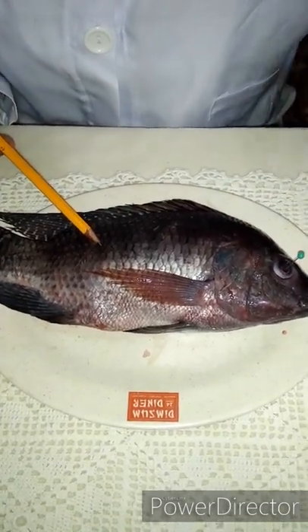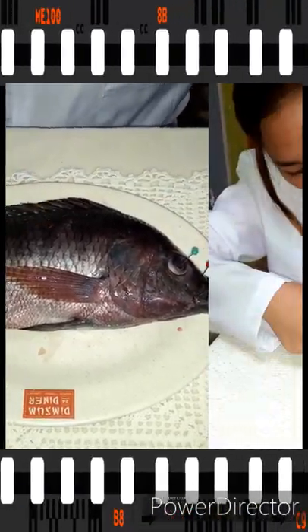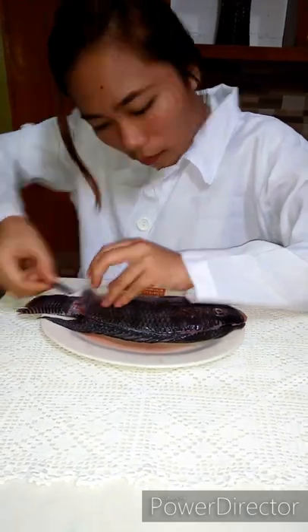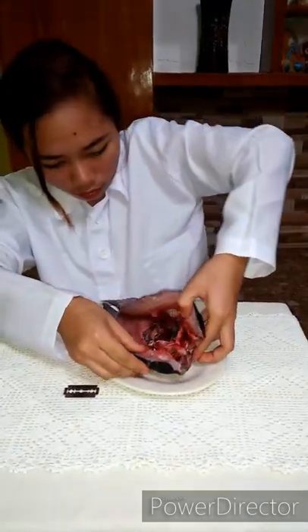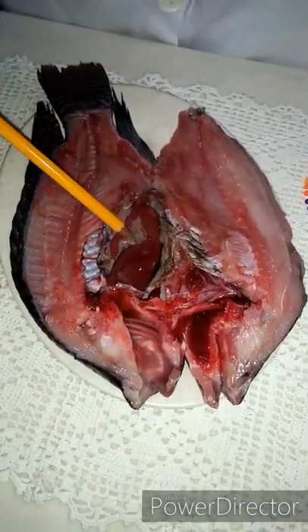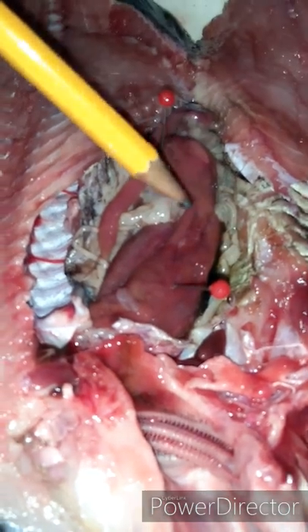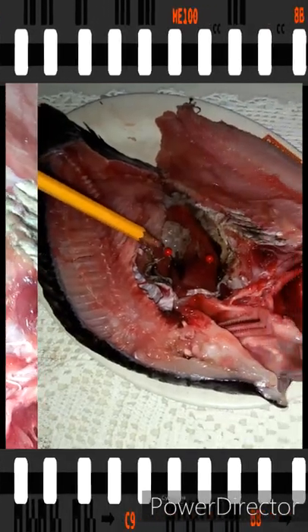That's all the external parts of the tilapia. Now we are going to locate the internal parts, so we're going to open this tilapia. These are the internal parts of the fish — this one is the stomach and this one is the intestine, which break down food and absorb nutrients.